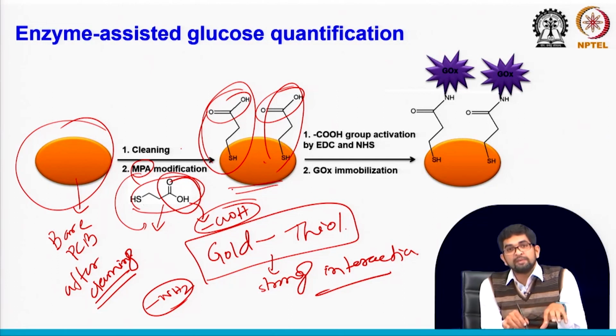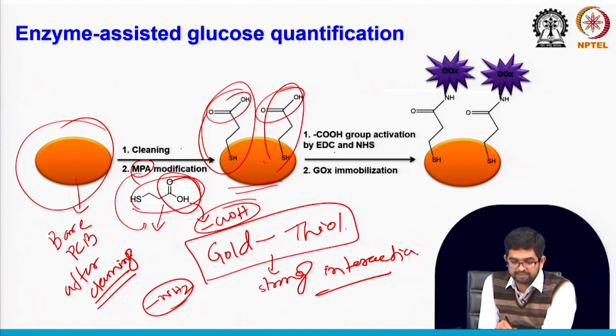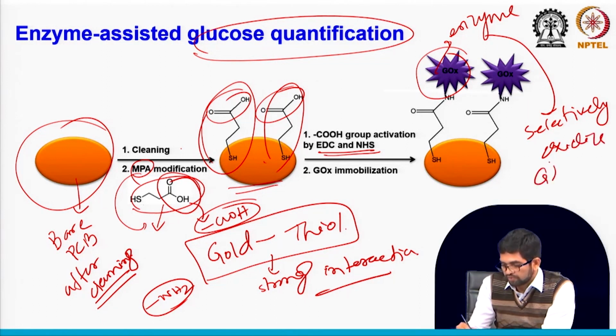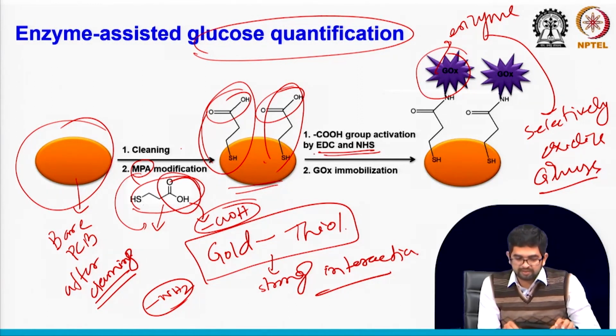You can remember, if you have the carboxylic group on your surface, then you can try the EDC-NHS activation process, right? For the glucose quantification we want to modify the sensor surface with glucose oxidase. The glucose oxidase enzyme will selectively oxidize the glucose. So this is an enzymatic biosensor, but here we are using some modification process for the MPA carboxylic group.